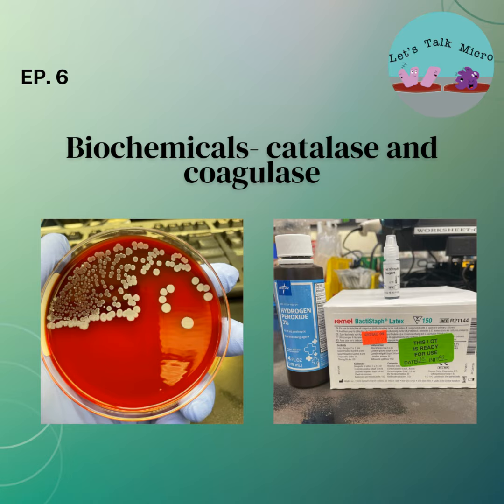Now, in your textbooks, and possibly some smaller labs in the US, some labs outside of the US, they use the tube coagulase. I did that years ago when I was in school. So if you actually perform that, feel free to leave some comments on my Instagram page or Twitter and tell me about the tube coagulase. Please share with the rest of the audience.